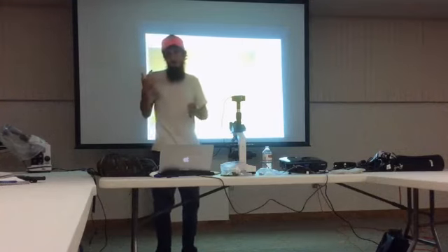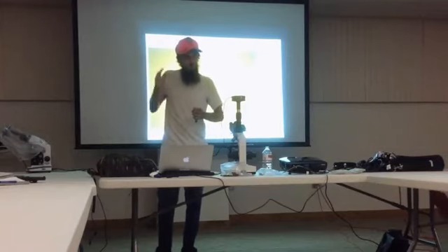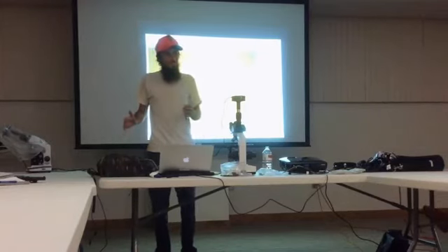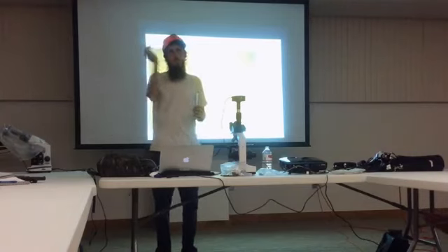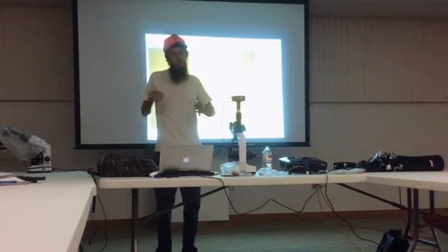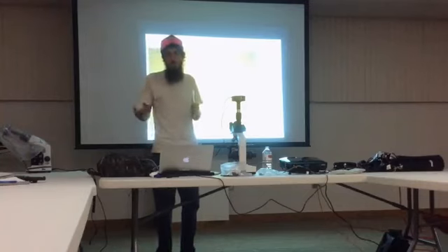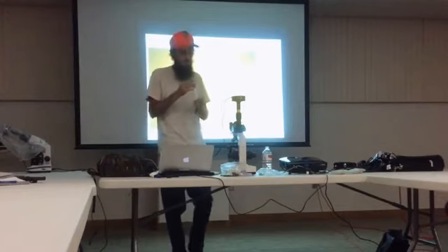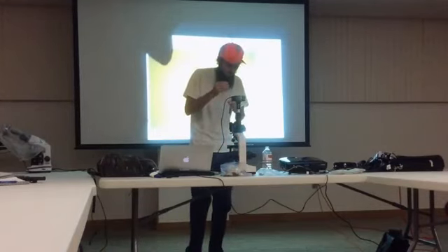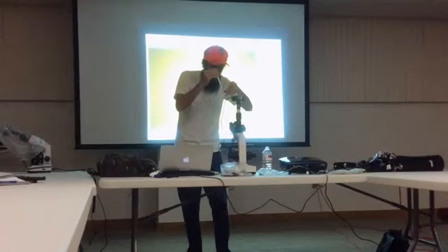And I look at my samples, and I've seen a fair amount of flagellates, not a whole lot, but I've seen them, but I've never seen an amoeba. And she lives up in Canada, in French Canada, the other side. That's just amazing, like if we're sampling our yard, she's naturally rich in amoebas and we're naturally not. Interesting. So yeah, having a database of soil, I'm gonna put 2 drops on you.